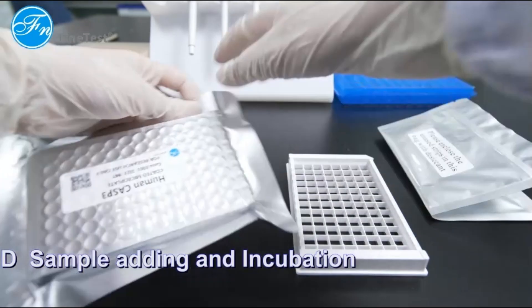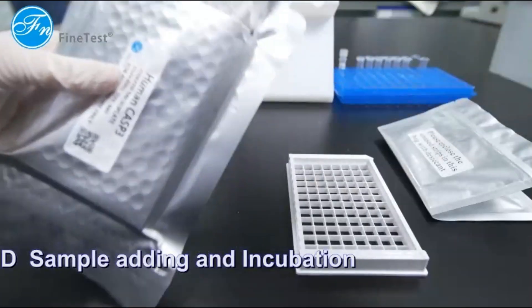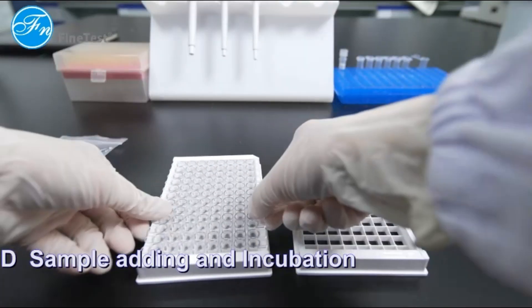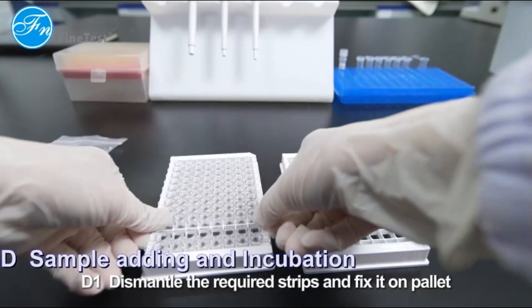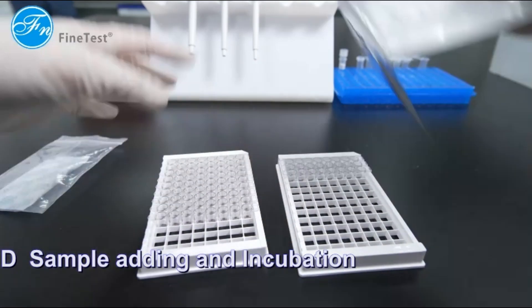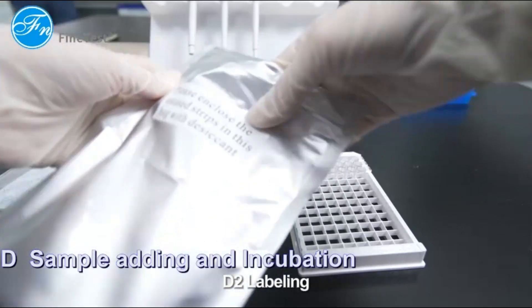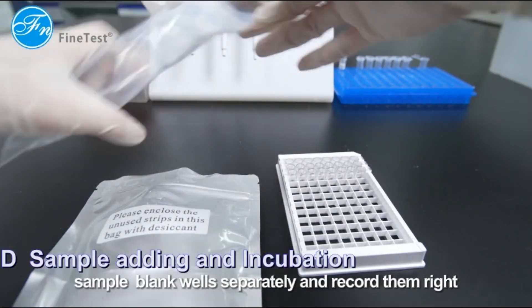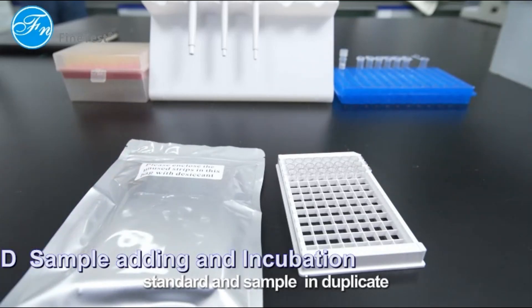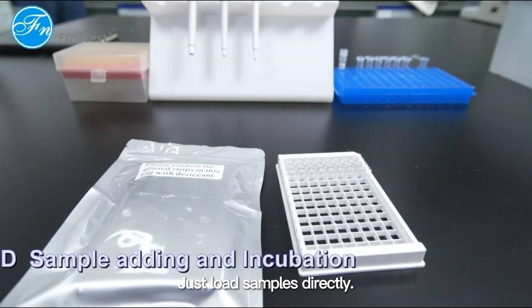Sample adding and incubation. Dismantle the required strips and fix them on the plate holder. Put the remaining strips together with desiccant into a sealed foil bag. Label standard, sample, and blank wells separately. It is recommended to measure each standard and sample in duplicate. For the RTU ELISA kit sample loading, just load samples directly.